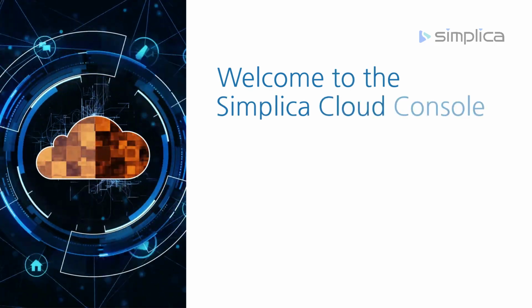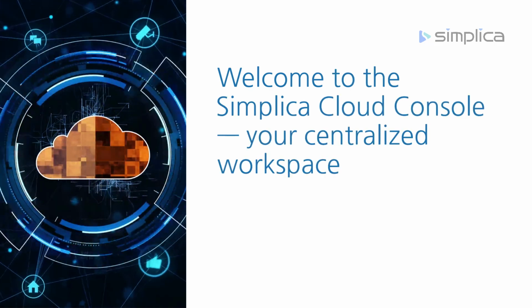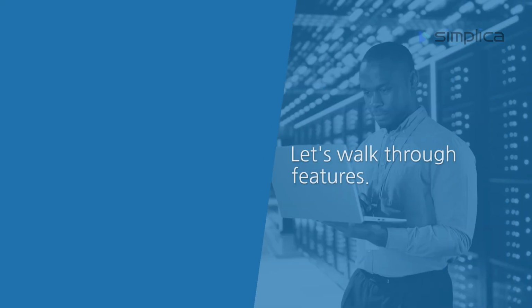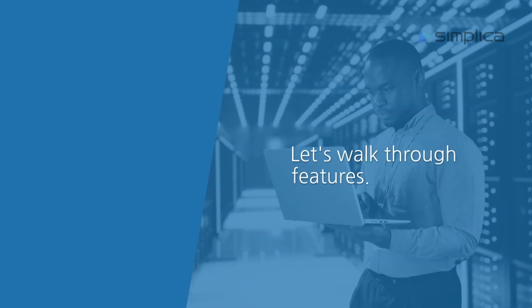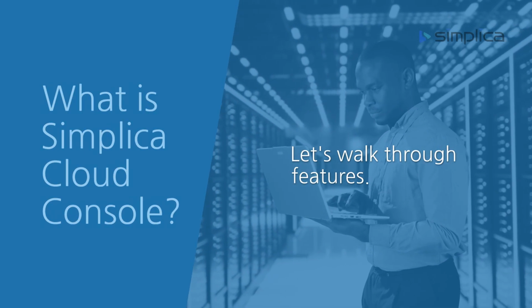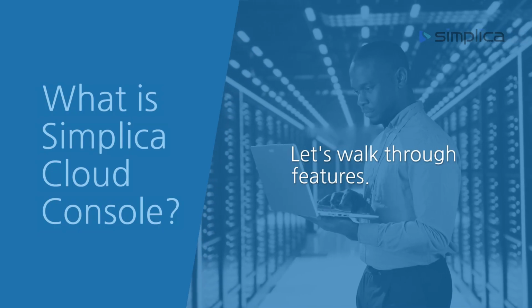Welcome to the Simplica Cloud Console, your centralized workspace for managing and monitoring LabWare application environments. At first, a console like this can feel intimidating. So don't worry, we'll keep things simple, practical, and walk through key features in this video.